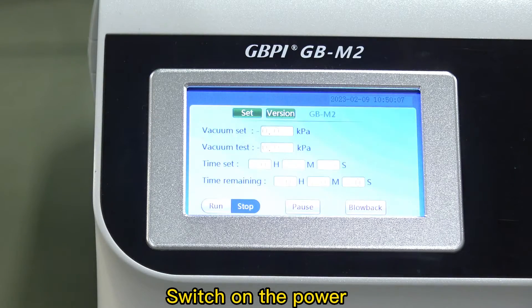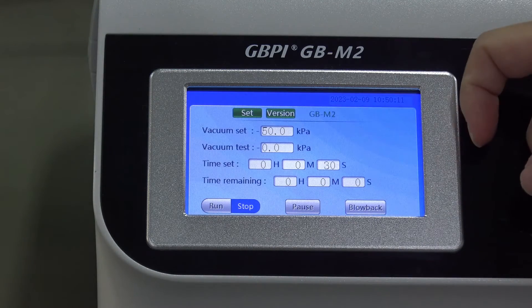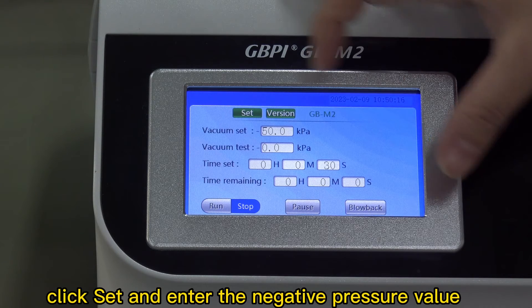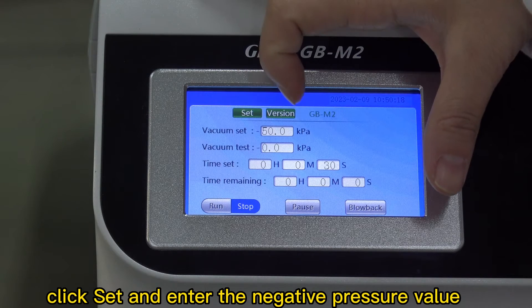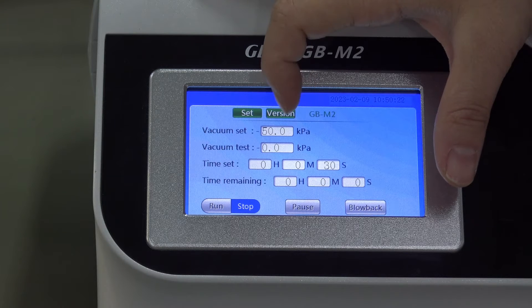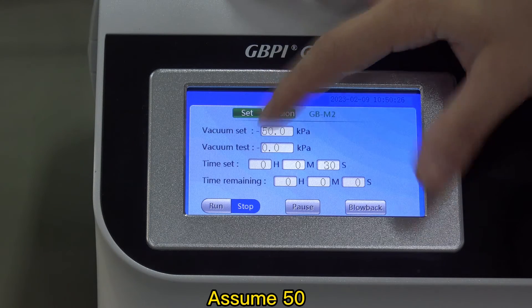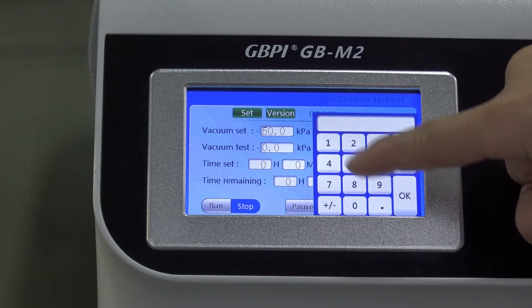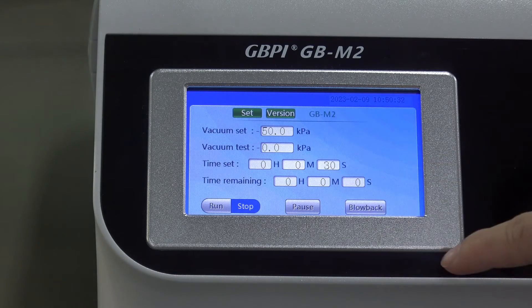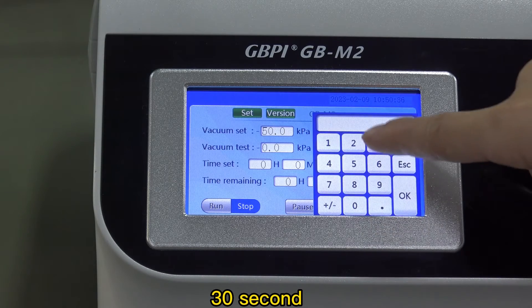Switch on the power. Click set and enter the negative pressure value — for example, assume 50. Set the duration to 30 seconds.